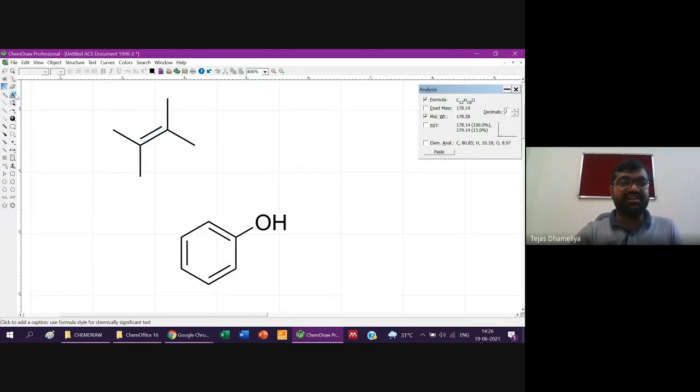Then you can write, let us say if you want to draw dichloroethene, there is one text tool. So you select the text tool, put on your chlorine, Cl. You remember organic chemistry. So this is the cis form of dichloro-2-butene, right? So that structure you can draw. This is actually a dash bond. If somehow you want to draw the dash bond, then you can take the help of this to draw the dash bond according to your needs.